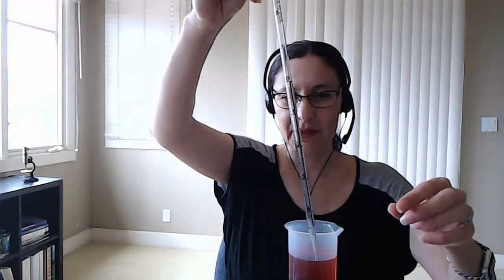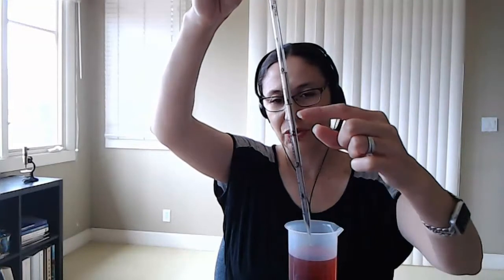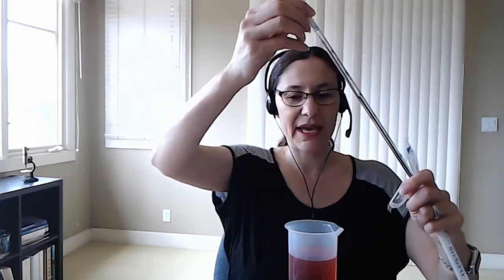The 5 ml pipette also has a cotton plug, and maybe you can appreciate the numbers better on the 5 ml pipette. It starts off with the bigger numbers 4, 3, 2, 1 up to 0. And then the 1 ml pipette, you want to open it in the area where the cotton plug is because the tip is sterile.